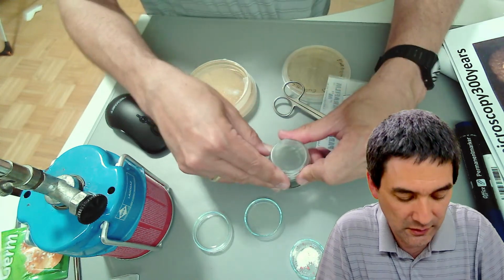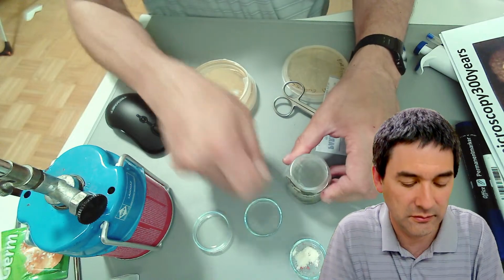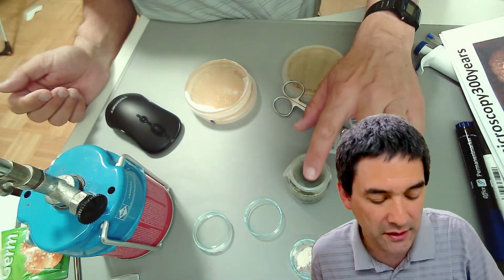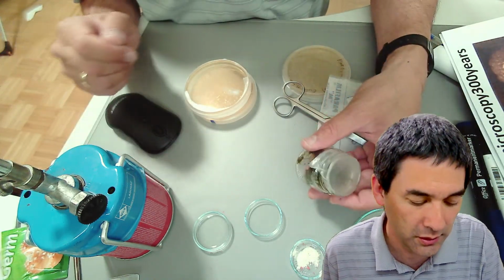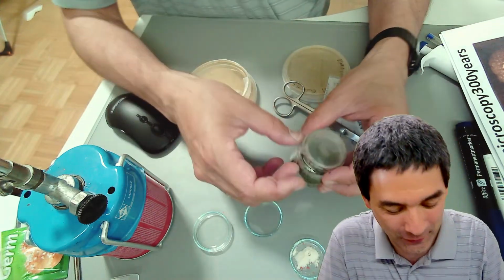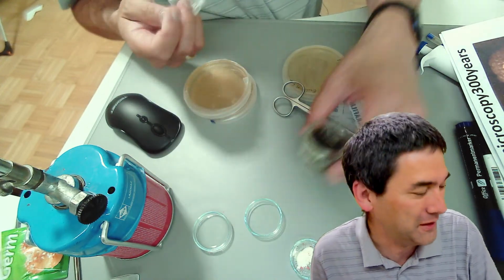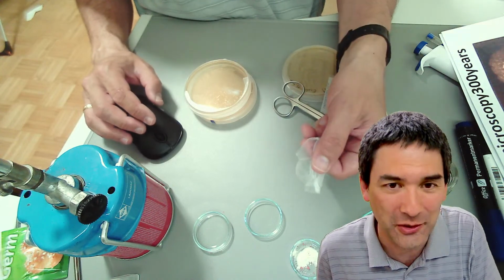Okay, and it makes an airtight seal. Yeah, that's basically what it's used for. So it's a general purpose tool, which is kind of fun to use. But of course you want to make sure that there is air coming into the moss, and that's why I'm going to remove it again. It's single use because you cannot use this anymore.